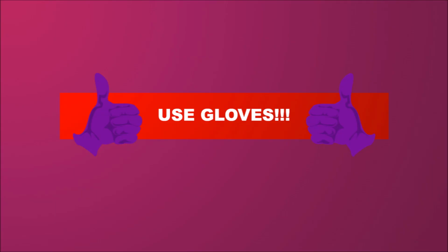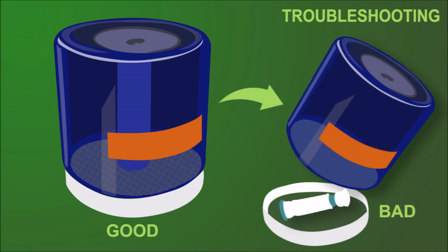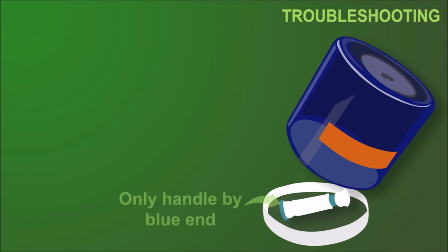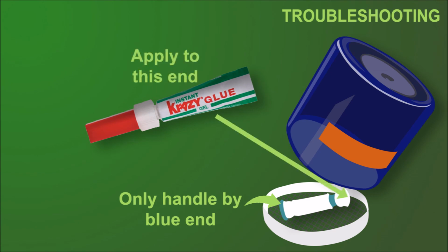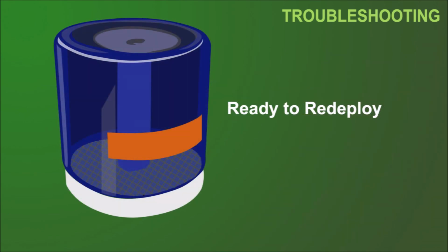Troubleshooting. Use gloves. If you find that the inner white cylinder has become detached, turn the sampler upside down and remove the lid. Only handle the cylinder by the blue end. Apply crazy glue to the cylinder at this end and attach back inside the housing here. Once you've replaced the lid, the sampler is ready to be redeployed.